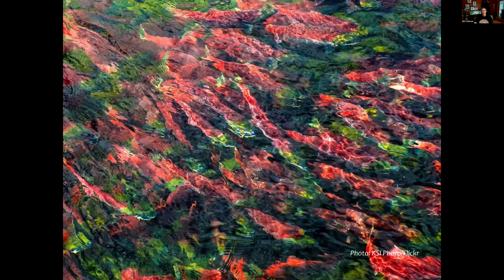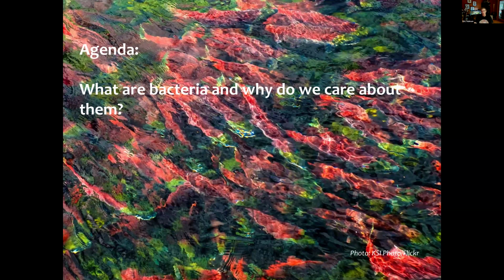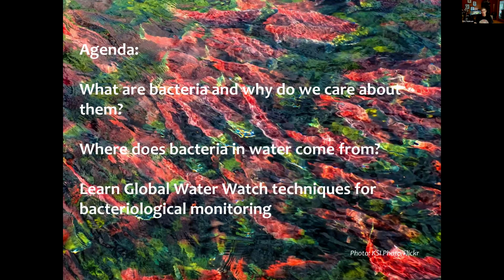So our agenda, we're going to talk about what are bacteria and why are they important? What are some of the sources of bacteria in water? And we're going to learn Global Water Watch techniques for bacteriological monitoring.